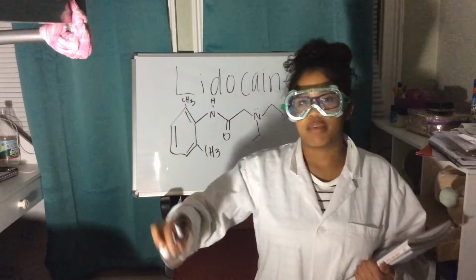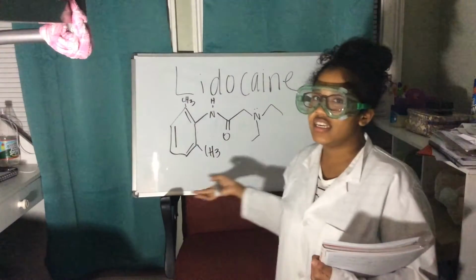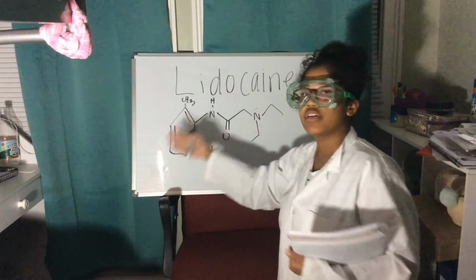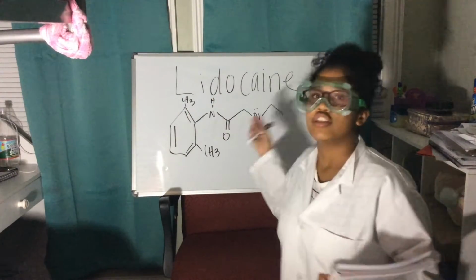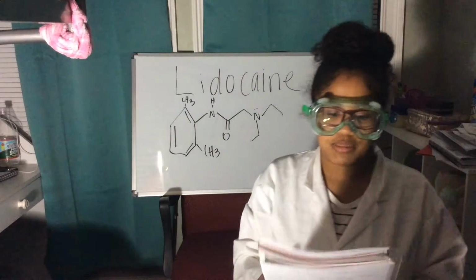Today we're going to be talking about the synthesis of lidocaine. Here is the structure of lidocaine. It's a two-step synthesis.